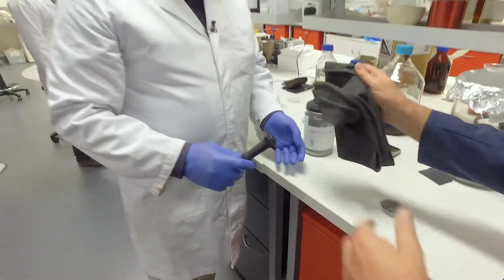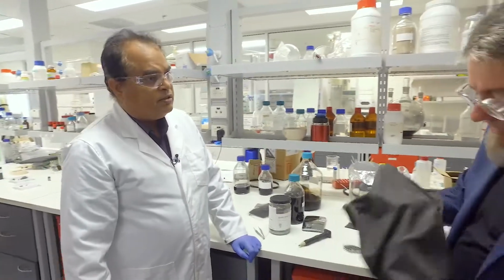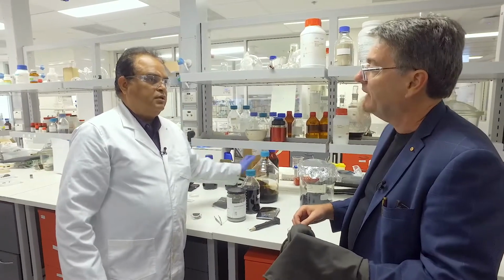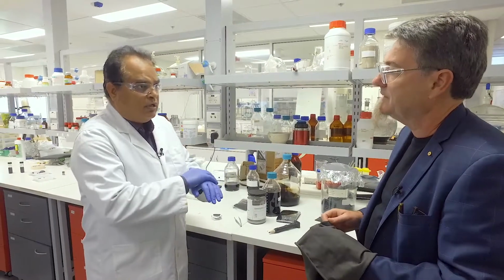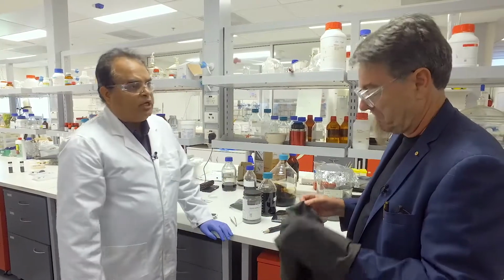So you take our dispersion, which is the graphene, and this fabric is coated simply by dipping into the graphene solution? Simply by dipping into the dilute solution of this material. And after that, it's reduced. Because graphene oxide has a lot of defects on the surface, we restore the aromaticity, and it makes the fabric conducting.